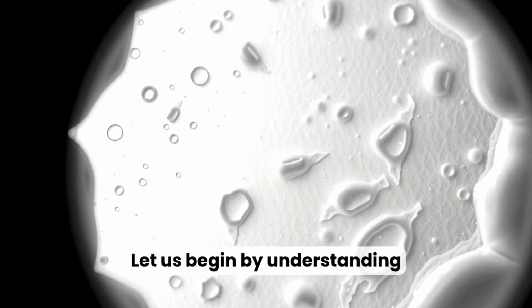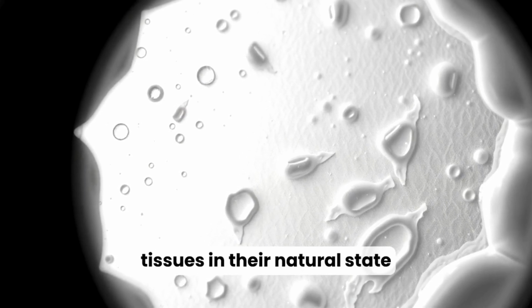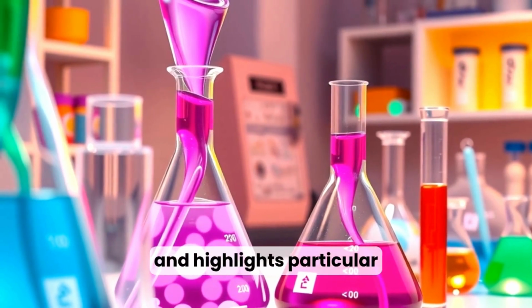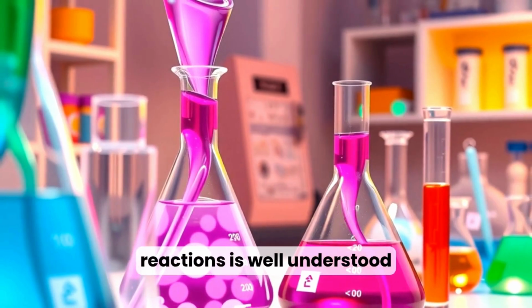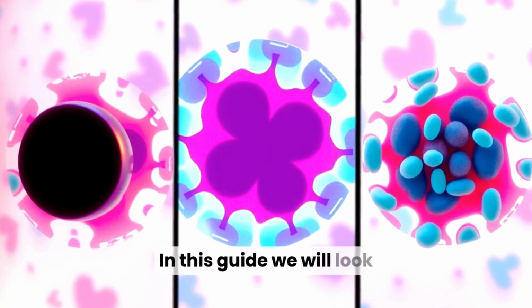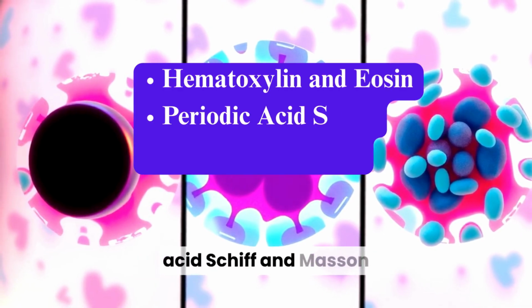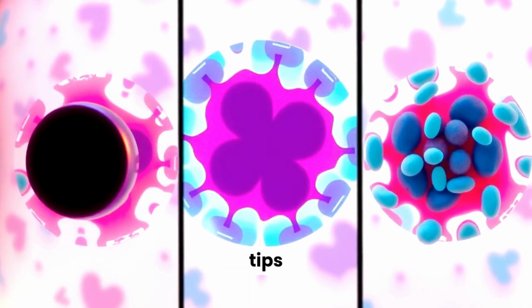Let us begin by understanding the basic concept. Biological tissues in their natural state have very little contrast under the microscope. Staining enhances visibility and highlights particular features of interest. When the chemical basis of staining reactions is well understood, we call this histochemistry. In this guide, we will look closely at three core methods: hematoxylin and eosin, periodic acid Schiff, and Masson trichrome, with labeled callouts and interpretation tips.